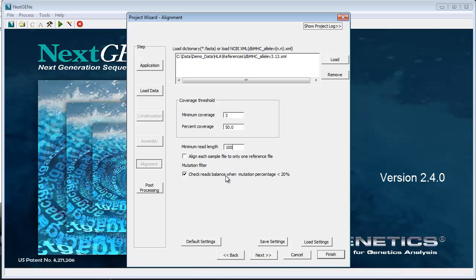Mutation filter check reads balance when mutation percentage is less than 20%. This setting can be used to exclude mismatches that are found at both low frequency and with a directional bias from being used for the allele calling.